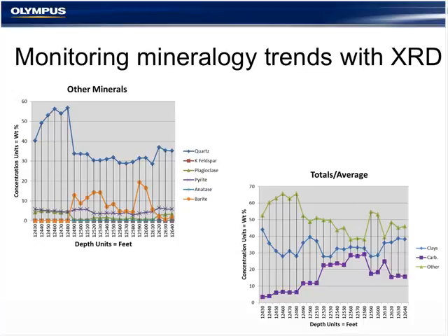Density plays an important role in analysis given the disparity between various components. For example, pyrite has high density in a smaller volume, and kerogen has a larger volume percent than indicated by weight. So XRD mineralogy provides bulk rock mineral weight percent, and to be clear, this doesn't include kerogen or porosity.